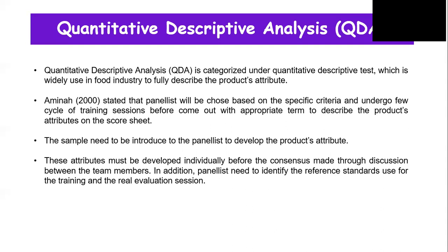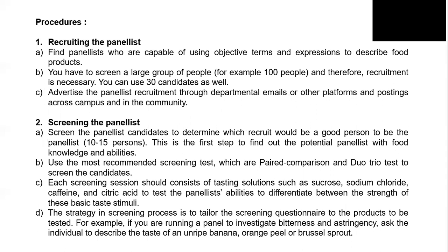Okay, we go one by one. How is this quantitative descriptive analysis carried out? It is a long procedure. First of all, the sensory team. Let's say I am the one who wants to have the result for my sample in descriptive test. So I will do a recruitment.